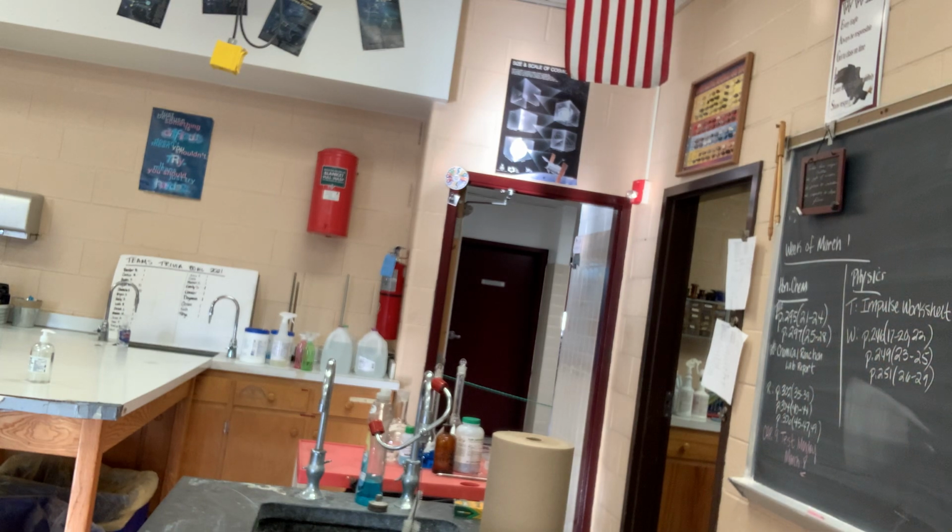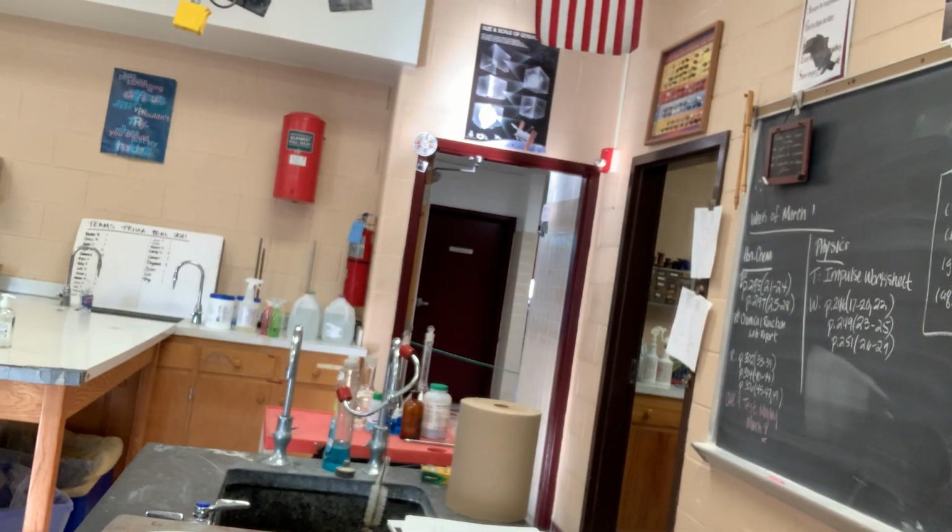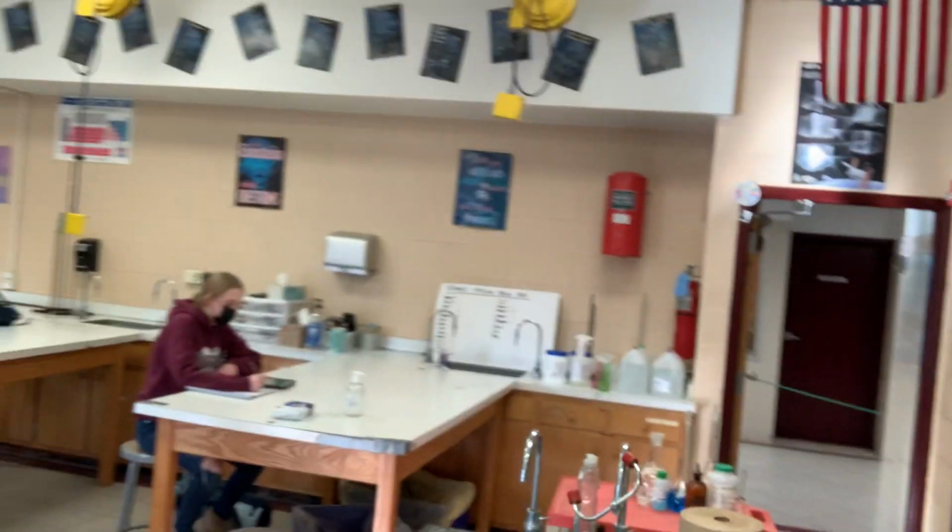I wish I could angle this. And my little green table's gone. I put it over here.